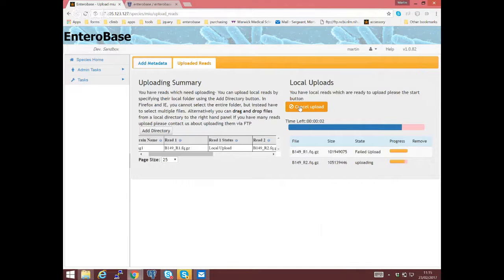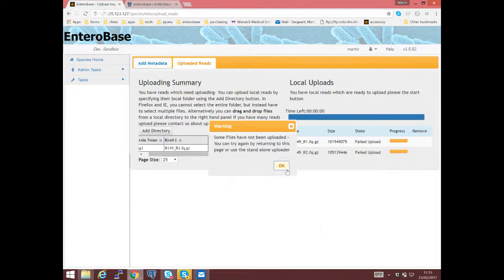Oh, you see, this is a failed upload, but I'm actually doing it on my development server, so there might be a problem there. But for this particular circumstance, it doesn't matter.